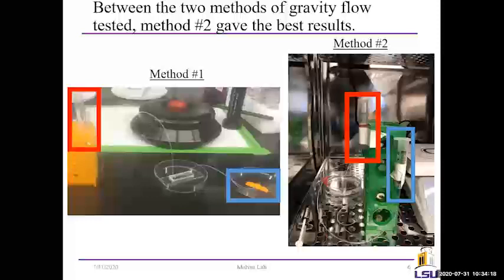My question is one that I've asked a couple of times. I got the whole idea of the breast cancer and all of that, the larger motivation, but can you tell me in a simple, straightforward sentence what you did and why you did it? What we did was we flowed water through plastic tubing into a small device that's essentially a piece of silicone with grooves in it. And the water flowed through the grooves into a collector. The goal of this experiment was to see how gravity and pressure would act on the water and how fast it would make it flow at different heights and syringe volumes.